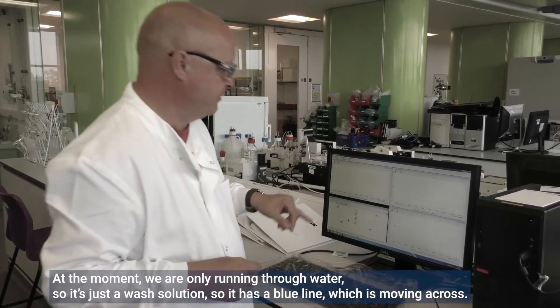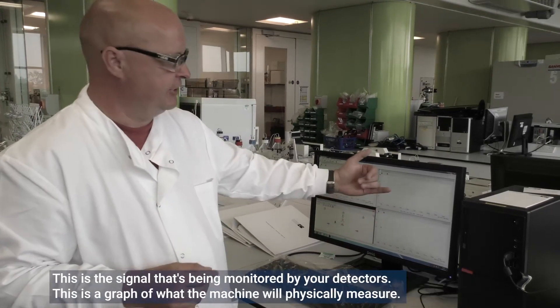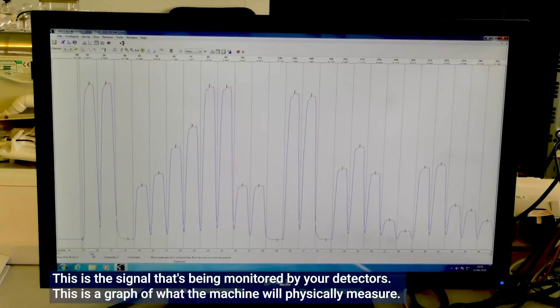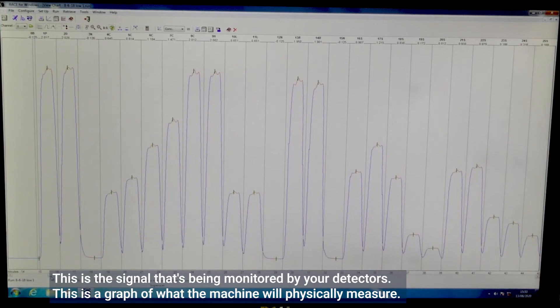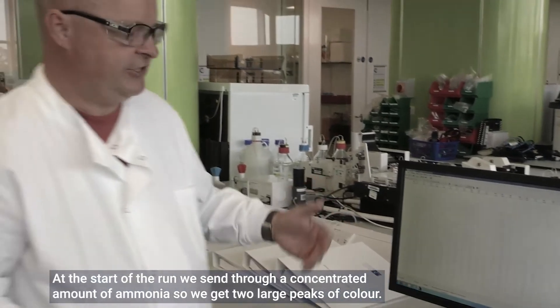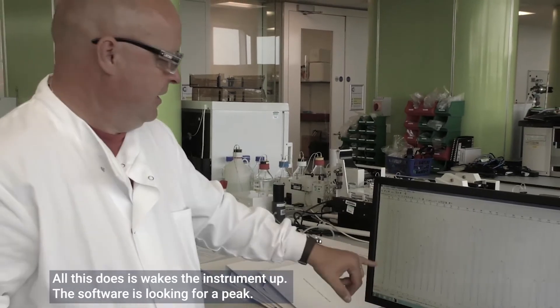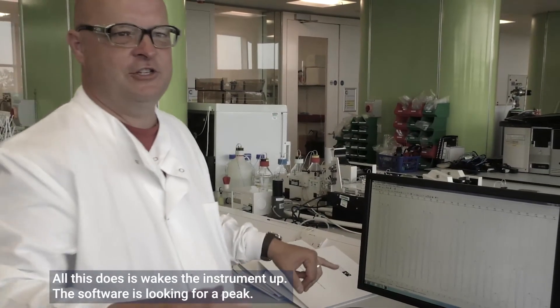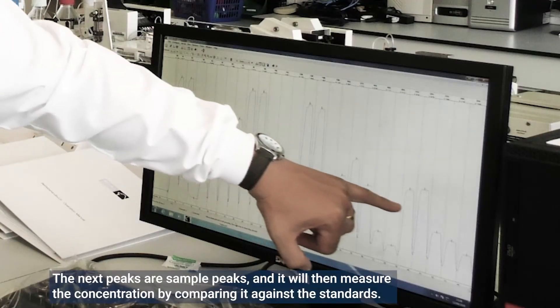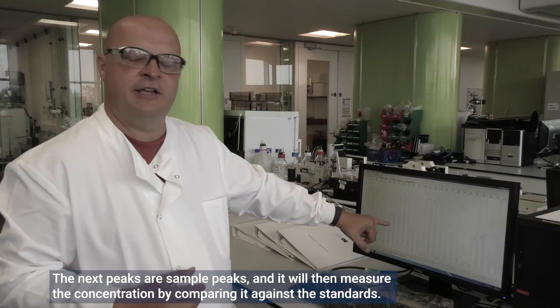At the moment we're only running water through, so it's just a wash solution. There's a blue line moving across — this is actually the signal being monitored by the detectors, and this is a graph of what the machine is physically measuring. At the start of a run we send through a concentrated amount of ammonia to get two large peaks of color — this basically wakes the instrument up. The software is looking for a peak, and the next peaks are sample peaks, which it uses to measure concentration by comparing against the standards.